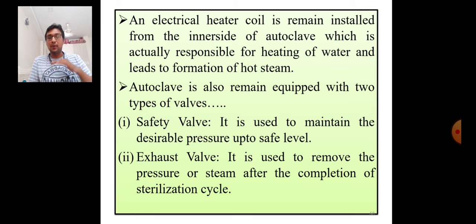ऑटोक्लेव्हच्या वेसलमध्ये प्रेशर वाढत असेल, प्रेशर वाढत असताना आपलं लक्ष जर त्याच्याकडे नाही राहिलं तर काय होईल? जी विसल आहे, सेफ्टी वॉल्वची विसल आहे ती ऑटोमॅटिकली लिफ्ट होते. ज्या प्रकारे कुकरमध्ये होतंय, प्रेशर वाढलं का विसल वाजायला सुरुवात करते, त्याच प्रकारे इथे ऑटोक्लेव्हमध्ये होतंय. जेव्हा ऑटोक्लेव्हच्या वेसलमध्ये प्रेशर वाढत जात आहे तर एका ठराविक पिरियड नंतर व्हॉट विल हॅपन, that the safety valve will get lifted automatically and the pressure will get released out from the vessel of autoclave, that is automatically.